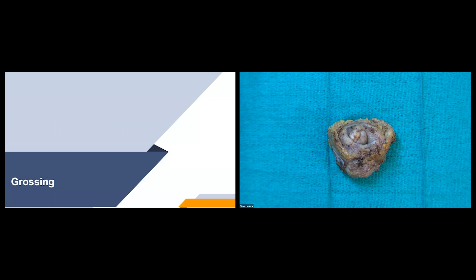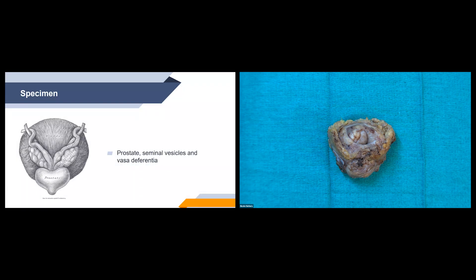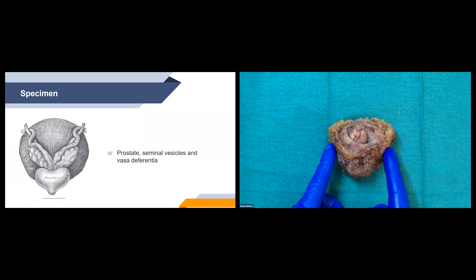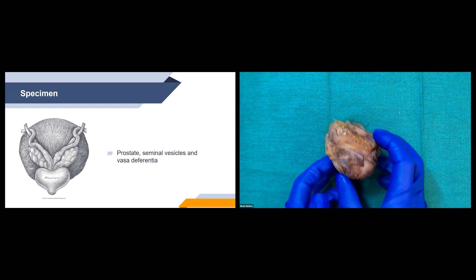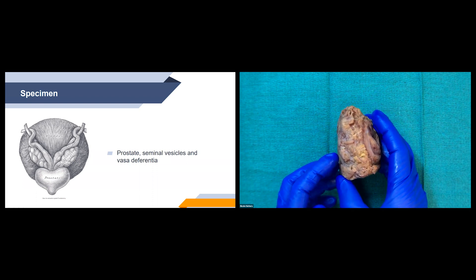For our grossing steps: first, we make sure patient identifiers are correct, check the clinical history — for this specimen it's out for prostate cancer — then go through the specimen, ink code, main findings, and section code. With the radical prostatectomy specimen we take measurements from base to apex, medial to lateral, and anterior to posterior. We also take measurements of both seminal vesicles as well as the vasa deferentia.